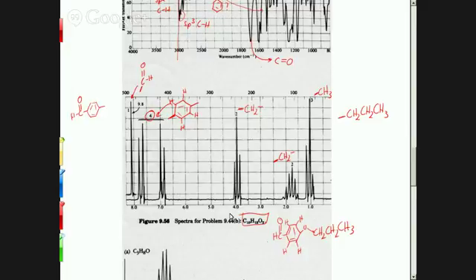It would be like a double peak and then this. Actually, this one should be a single one. I don't know why that has that. Probably that same row. And then that is just a mess. So we can't go off that. You won't be able to assign all the splitting in this one because there's just too much mess in that region, but you should be able to do it with the integrations.